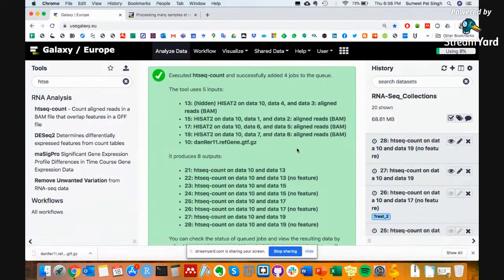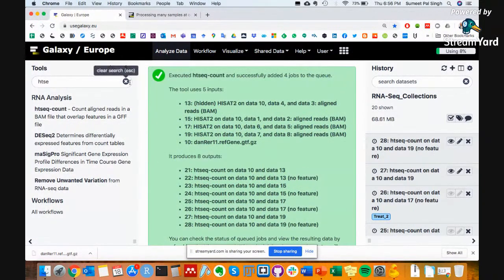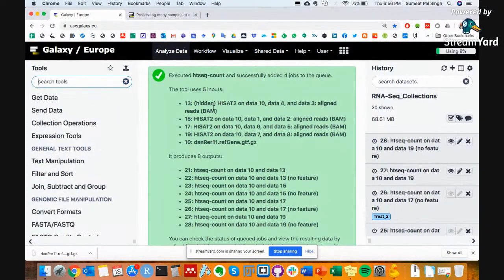And then next week we will discuss how to do ATAC-seq, but it's pretty straightforward. Once you are used to Galaxy, you can just search online for which tools to use, and you just have to put the tools together. But we will discuss a few intricacies of ATAC-seq and how it differs from RNA-seq.